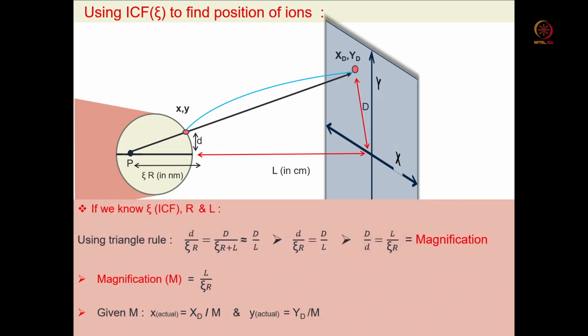Based on simple geometry, there is another assumption: the atom located at the tip surface which is going to be ionized is projected on the plane perpendicular to the tip axis.